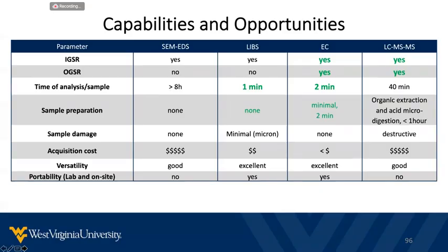In terms of time of analysis, electrochemistry and LIBS provide unprecedented capabilities. For instance, just to give you an example, we were able to analyze thousands of samples that we collected in the summer from the Jamboree in just 4 days with both methods. We are, in comparison, still analyzing samples from the summer by SEM-EDS. SEM-EDS is a lot slower and definitely our bottleneck.